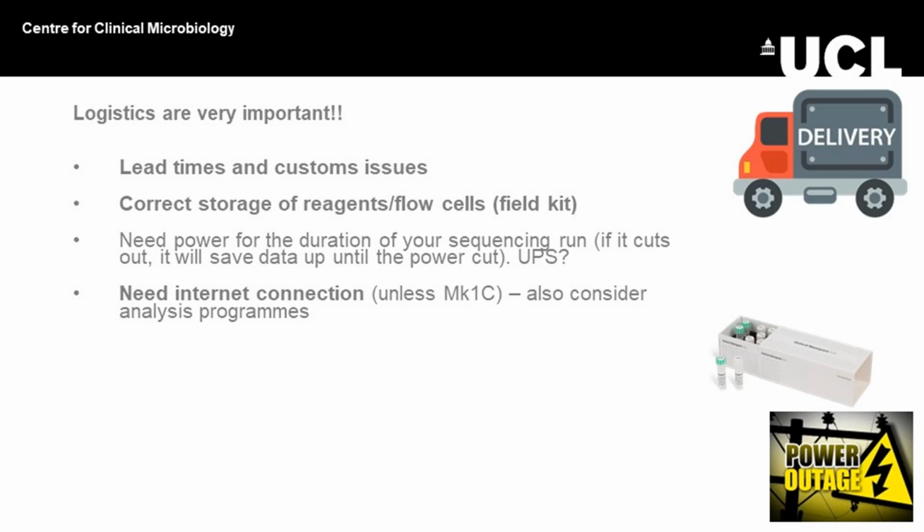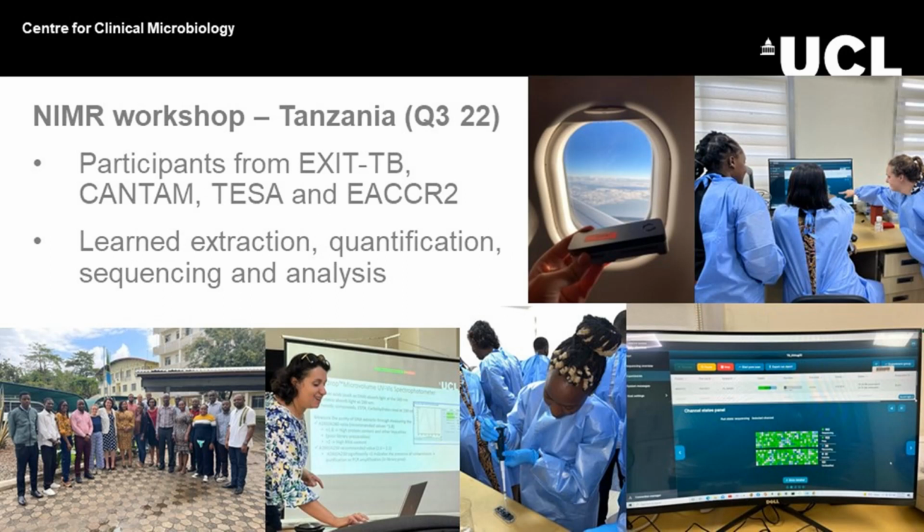You can run them off laptops if they're powerful enough, so you'd have that backup of the battery, but to be honest, sequencing on a more powerful computer is probably the better way of doing it. But you have to have power for at least, so I tend to run it for 48 hours, but you can run it up to 72 hours.